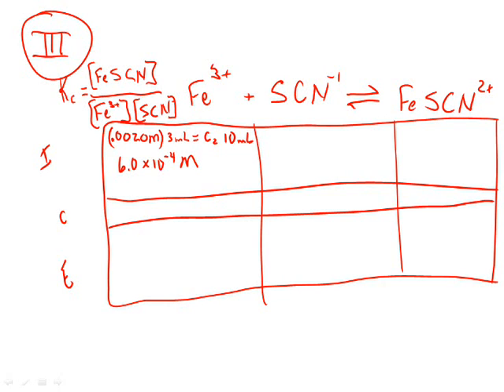So that may be the same for the initial molarity of the iron in each of your 4 tests today. Is that right? Do they use the same volume all the way down that column? Oh, that was easy. We just did one big set of calculations. What's the initial concentration of the thiocyanate? Correct me if I'm wrong. Is it 0.002 molar as well?